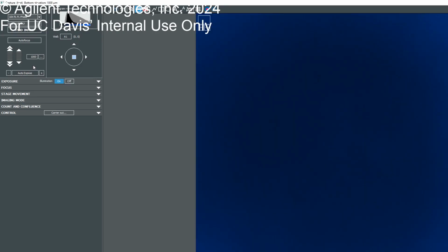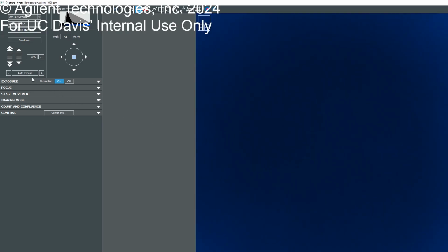Yep, and now if you're using this plate type for autofocus, you can see how that's not going to work, right? So now we have to use either the autofocus option or the coarse focus option to first find where the cells are located. And see, it's just failing because it's too far away from it. So now we click OK and just find this coarse focus option and go up from there. Coarse focus, this one, yeah. You go up until you see something.